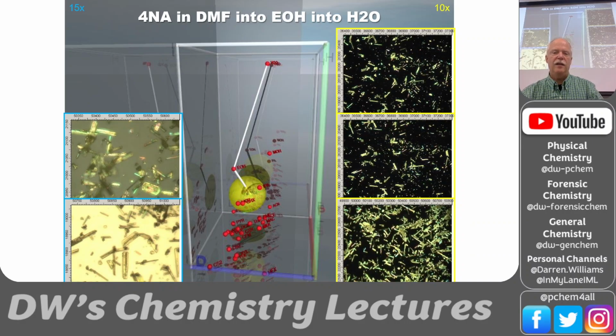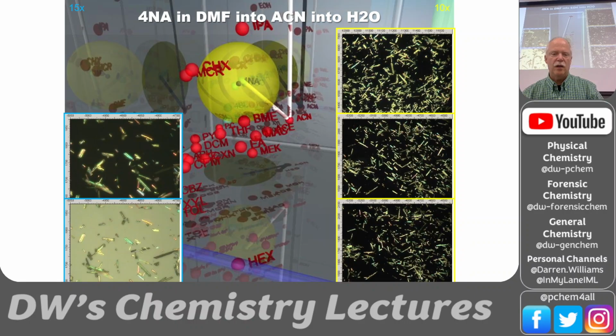Here's when we went into ethanol, similar. Although with ethanol, we start to see some plates. So here's a plate here in ethanol, okay? Again, some good colors, so we're seeing some more pure crystals.